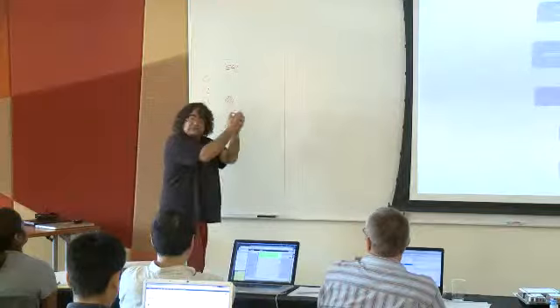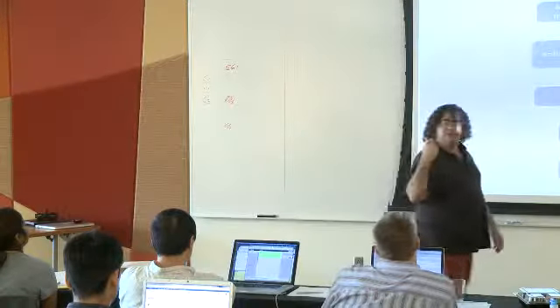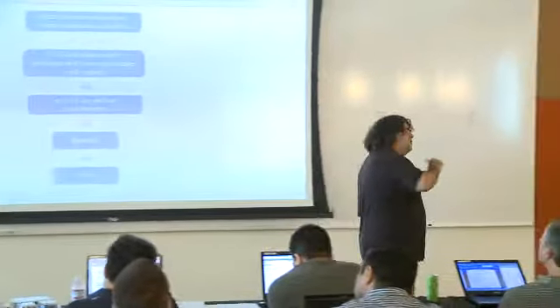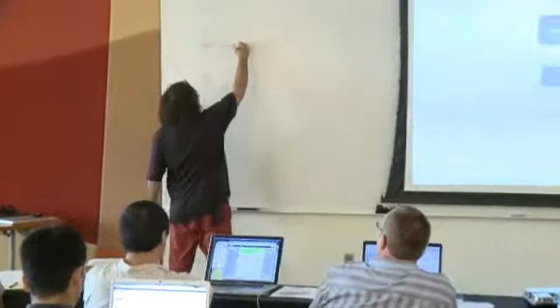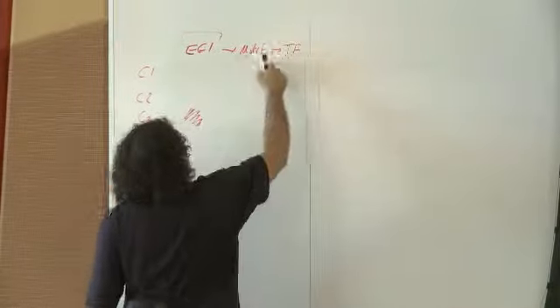When you look for motifs, you find that there is some motif enriched under these sequences. Okay, in these elements, there is a motif. And you can then even ask, is it a known motif? Is it a motif where I know which transcription factor uses that motif as a binding signal? And you find, yes, there is a certain transcription factor. So from this, you find a motif, and you find a transcription factor associated with that motif.